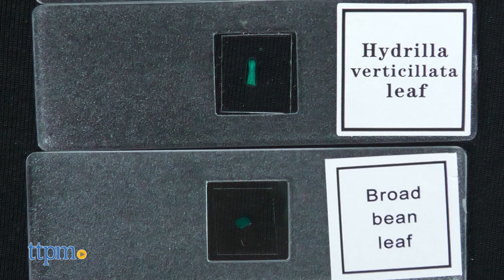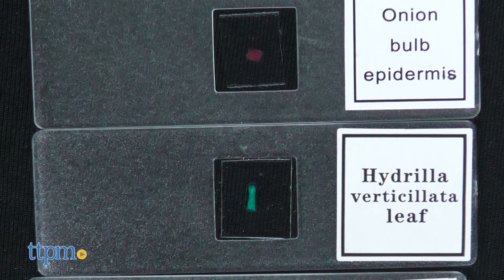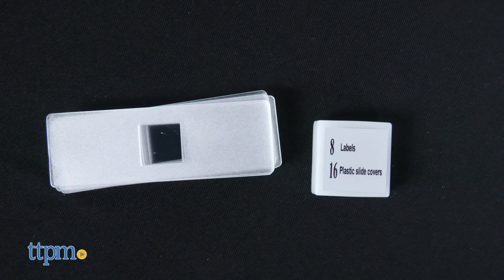Kids can start off with the three prepared slides, which lets them see up close two types of leaves and an onion bulb epidermis. Then kids can find their own samples for the eight blank slides and slide labels.